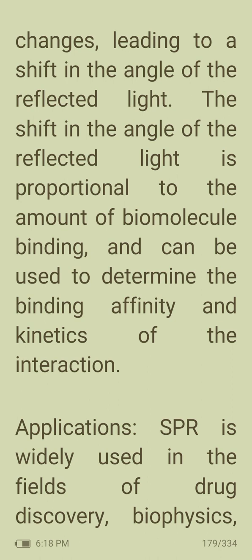The shift in the angle of the reflected light is proportional to the amount of biomolecule binding and can be used to determine the binding affinity and kinetics of the interaction.